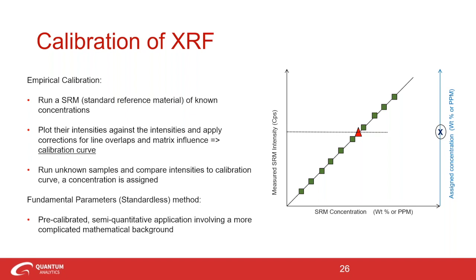And now, empirical testing modes are only suited for measuring samples for which chemical compositions fall within the narrow calibration range. And interferences like spectral and matrix must be taken into consideration within the calibration. So the method is the most accurate and widely used in process control where similar well-known reference samples are available, right?